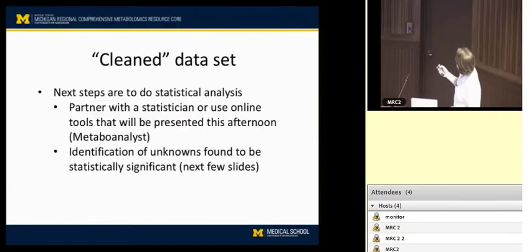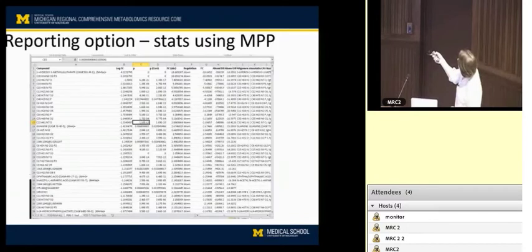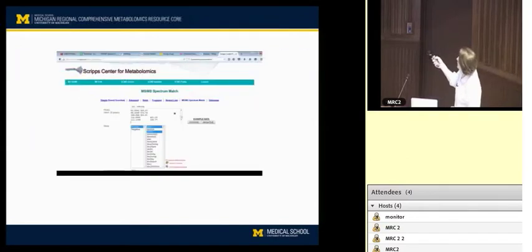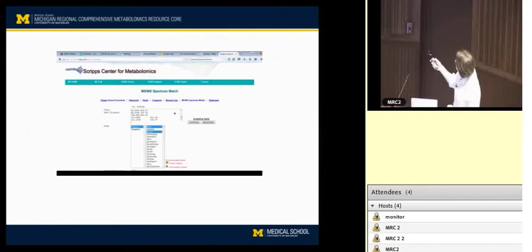So that would be, and I'll be very close. Okay, now my very, very brief about that, to say that we use a number of techniques. Metlin would be one where you essentially fragment your ion of interest, you collect a spectrum that has your parent and all the fragments, and you tell it some things about what you expect, whether it's a molecular ion or whether it has sodium or things like that.